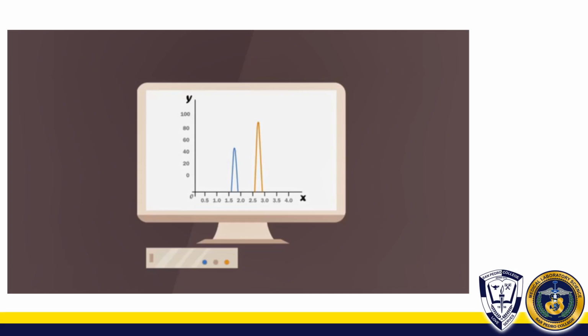So it is able to detect whatever sample was vaporized, and any changes that happen in the FID are being recorded, as you can see here as peaks. So it is being detected and then recorded, and the height of the peak on the graph is equivalent to the concentration of your sample. Do not worry, we will discuss the basic components one by one.